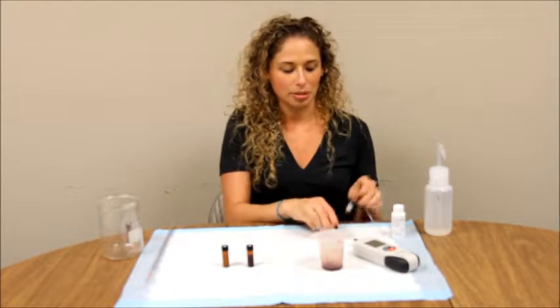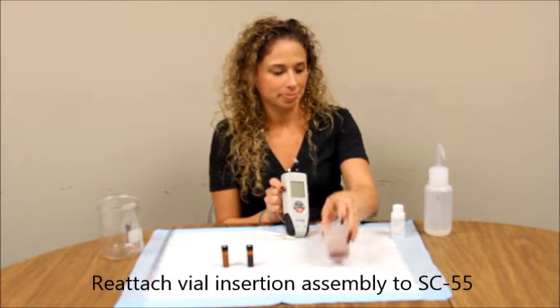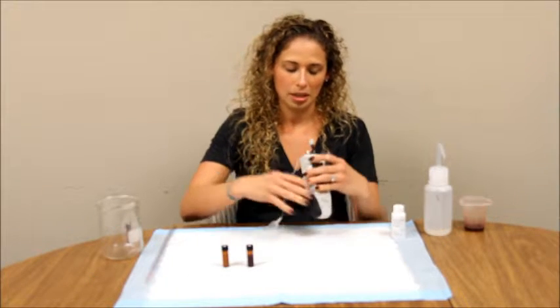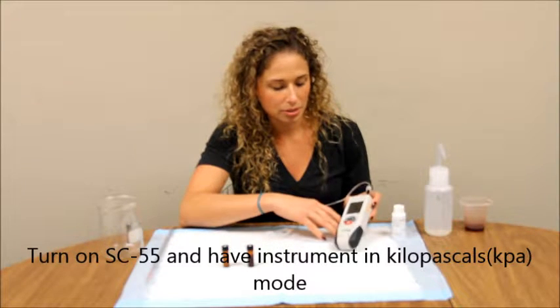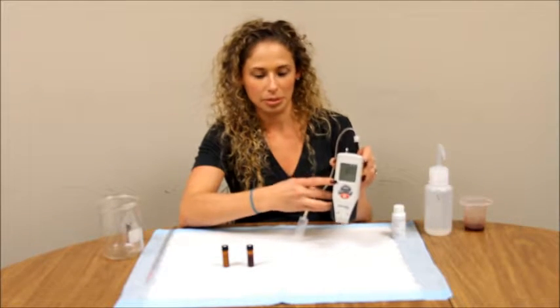Before the pressure reading step, make sure and reattach your vial insertion assembly to your SC55. Turn on your SC55 by pressing the red button. Make sure your instrument is displaying in kilopascals or kPa shown in the corner.